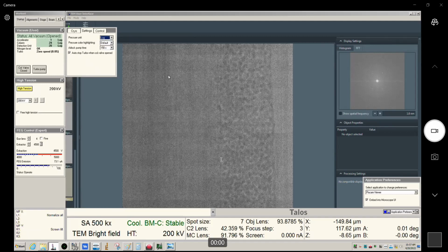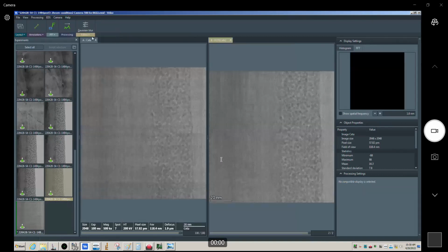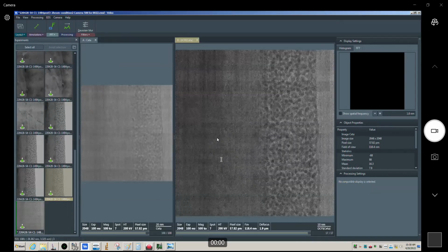Thank you. Sure. All right, so let's give this a shot. One thing I'm a little concerned with here, because the signal in each of these frames is so crappy, I don't know how well it's going to do the integration, but we'll give it a try. And it looks like it's working pretty well here. You can see things improve as it's adding up the frames.